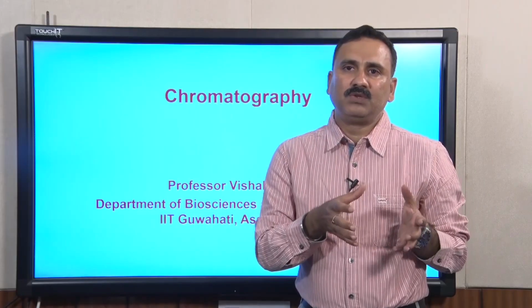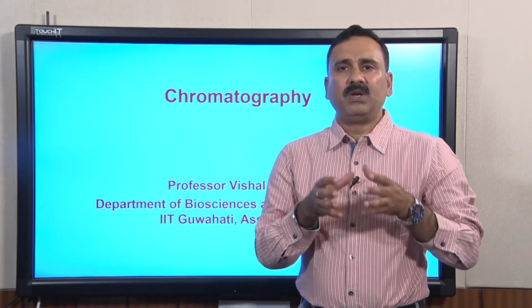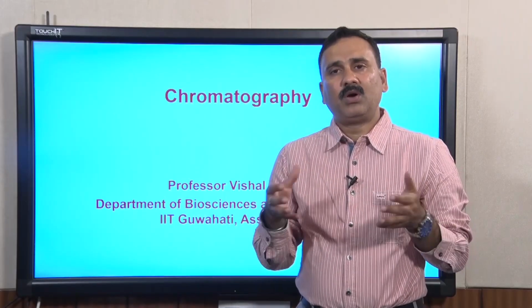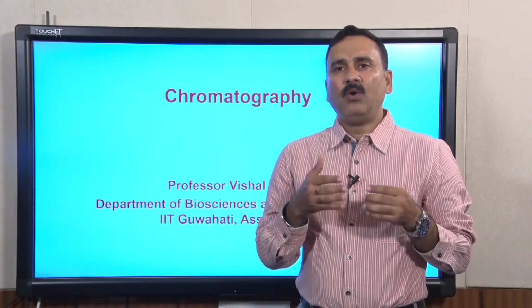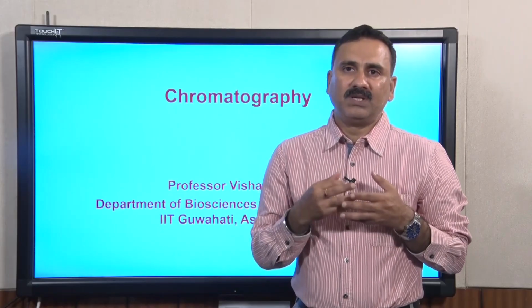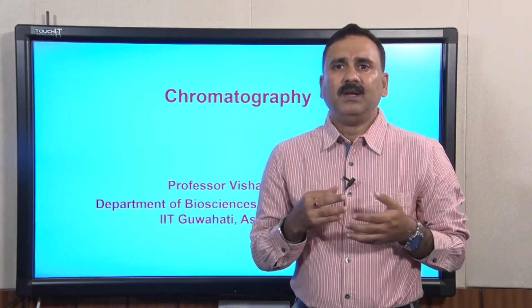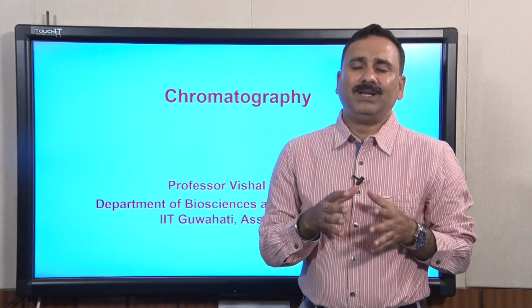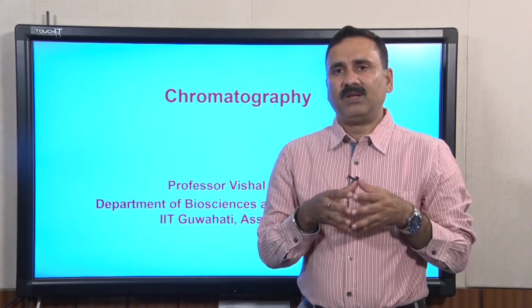The protein which you would like to purify is called the desired protein. The proteins which come from the host are called impurities or contaminating proteins. In today's lecture we are going to discuss how to purify or isolate the protein of your interest. This process is extensively done by employing chromatography techniques, but before getting into the details of chromatography, we are going to discuss the basic principle of separation.